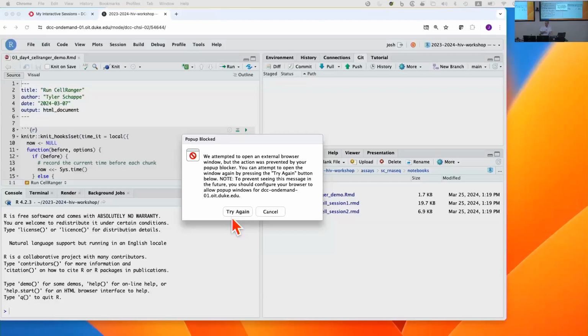One is in single cell RNA-seq, where you want to avoid double counting what are called PCR duplicates. There's an amplification step, a PCR step, or I guess it could be a linear amplification step. If you have two reads that actually came from the same initial RNA, you don't want to double count those, because your goal is to figure out how many original RNA molecules there were. So if you have two reads that look identical and have the same UMI, you usually collapse those down into one.